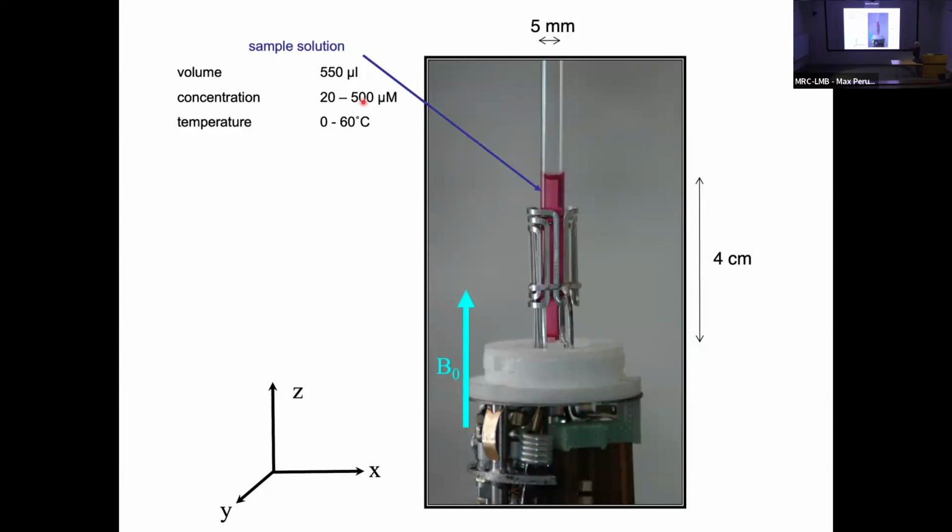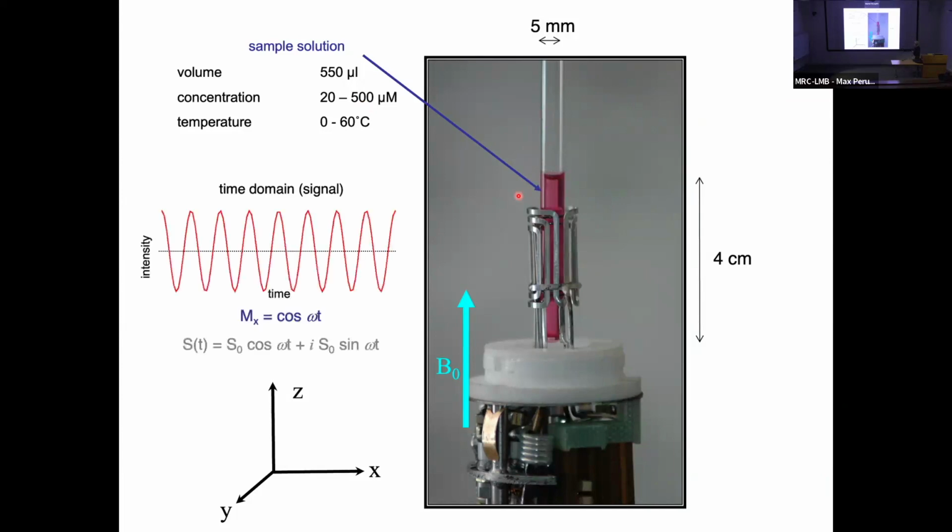So the magnetization is pointing directly up the z-axis of the tube. We can give a preparation excitation pulse where we flip this magnetization from the vertical axis into the horizontal plane, and this magnetization then starts to precess, to spin, if you like, around the central axis at a very characteristic frequency, at its resonance frequency for this molecule.